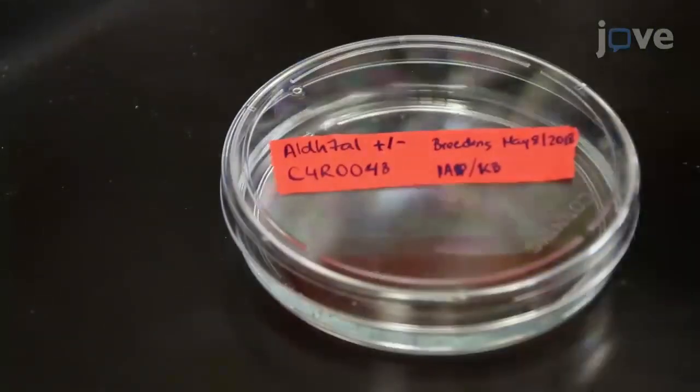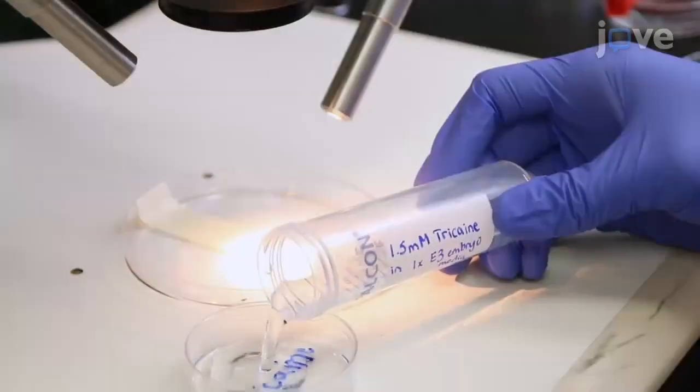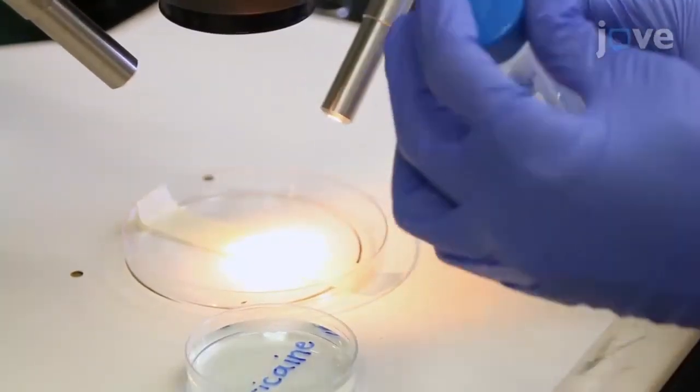Place 3 to 5 day larvae in a petri dish and anesthetize in 1.5 mM tricaine in 1X E3 embryo medium.